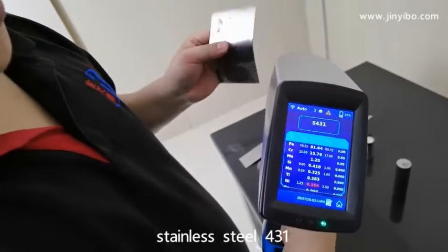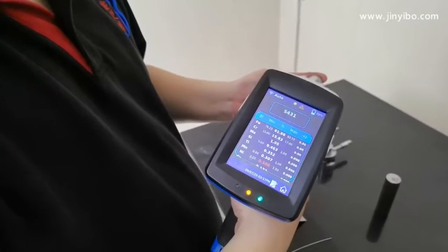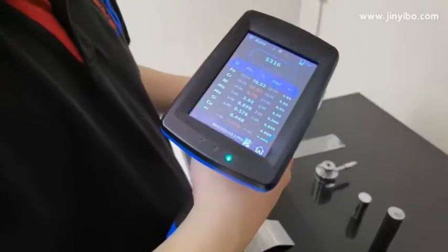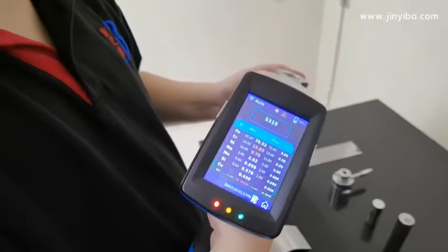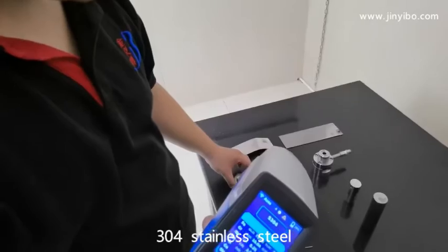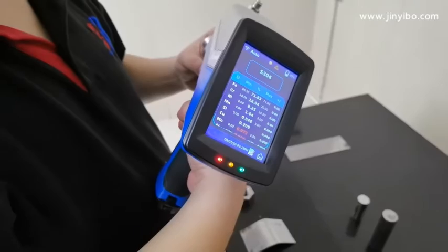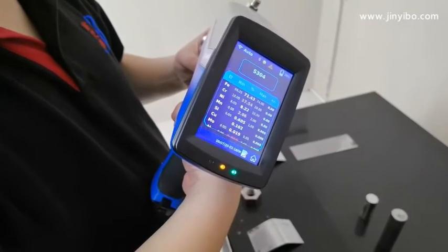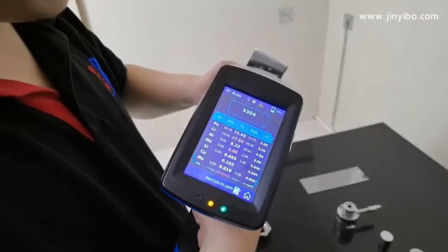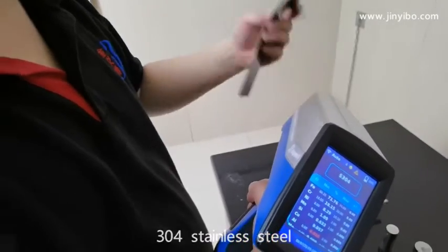Standard steel sample. Let's continue — this is 316. Standard steel. 304 standard steel. 304 standard steel.